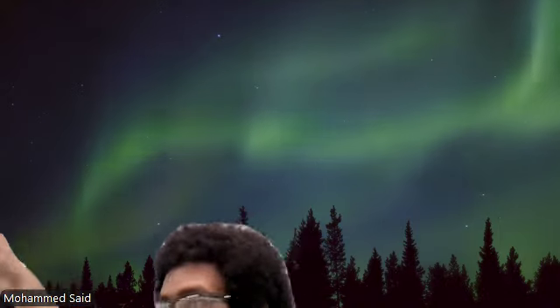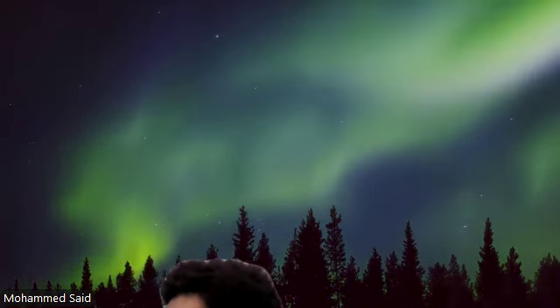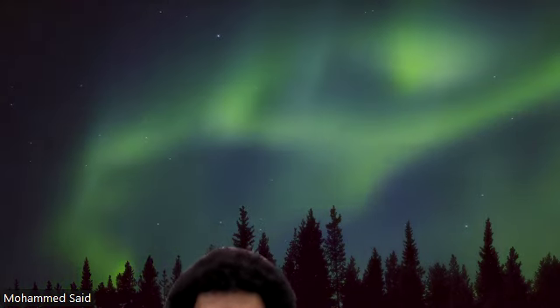As soon as I place the E. coli into the flask, the 2 benches or 2 quadrants here have to bear in mind that they have a timer for 5 minutes, because I'll be also doing things at the same time. I likely will be very preoccupied, so I can't really answer questions unless you have them now.